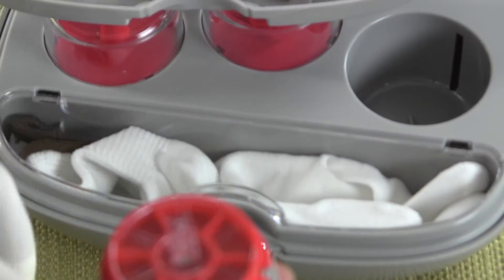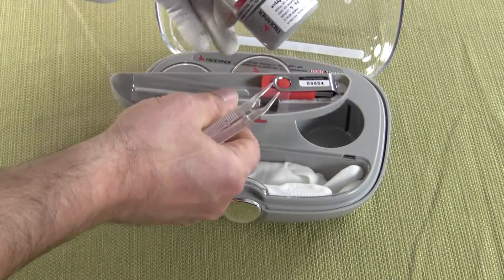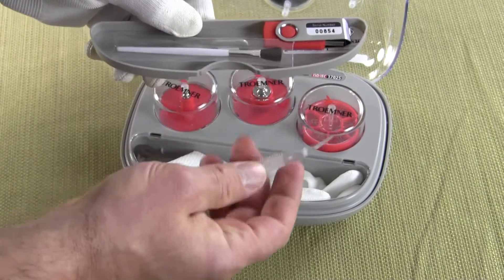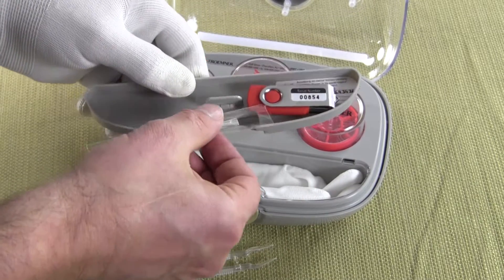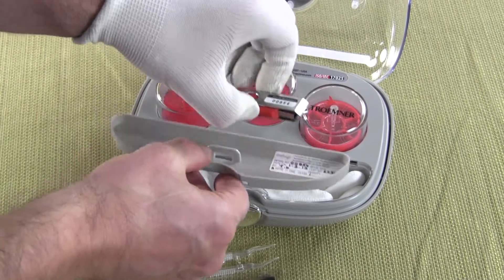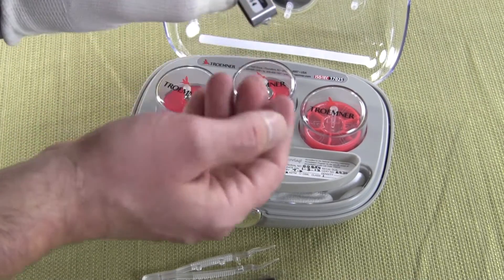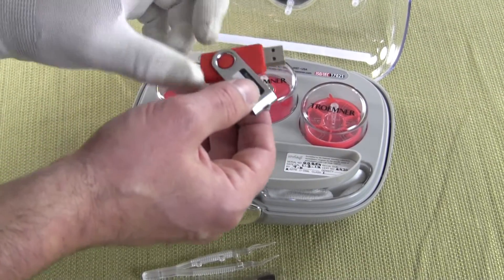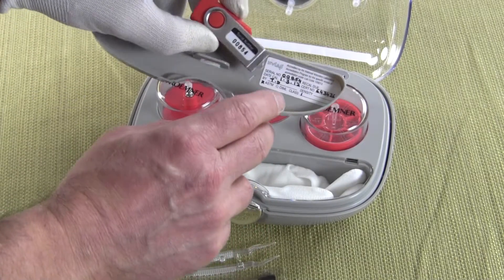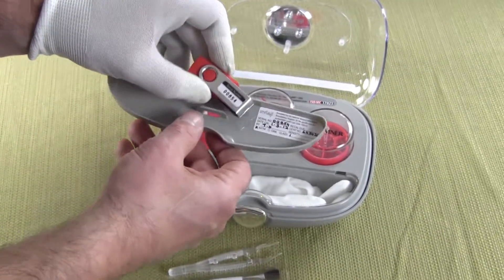The kit really comes with everything you need to calibrate a balance, and there are about 20 different kits we have to offer. In the tray you have your forceps, a little brush so you can clean the area where you're placing your calibration weight, and a USB drive. That USB drive contains your calibration report — it has a NAVLAB report on it, so all your documentation is on the USB drive. They also write down in the tray the day the CAL was done, who did it, and the CERT number.